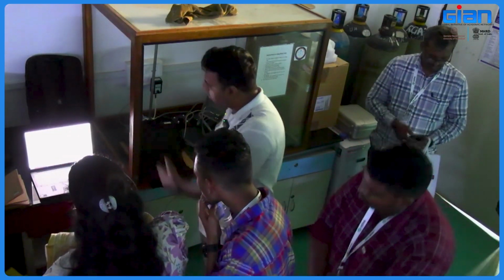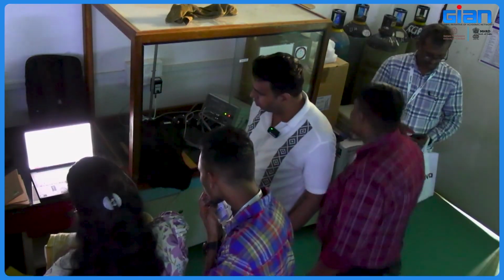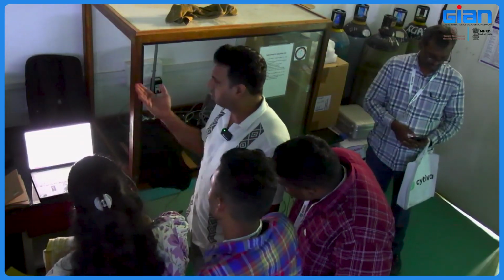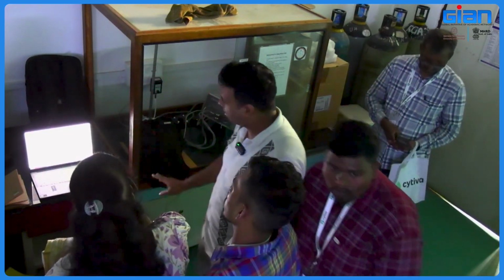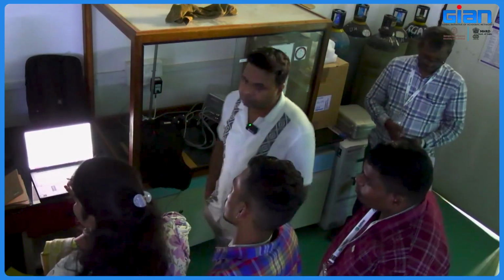While exporting, you can just export and these will not come. Those are standard. No, these are fitting parameters just to check how proper the fit is. Some people fit the ETR. ETR will be a jagged kind of curve, that time they fit, but there is no need of fitting. Done.